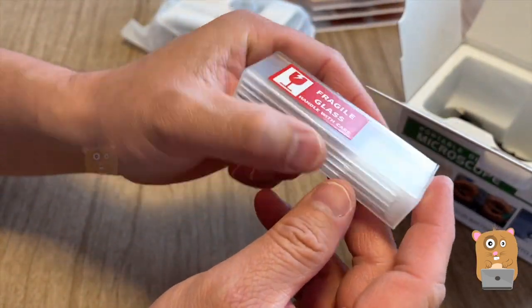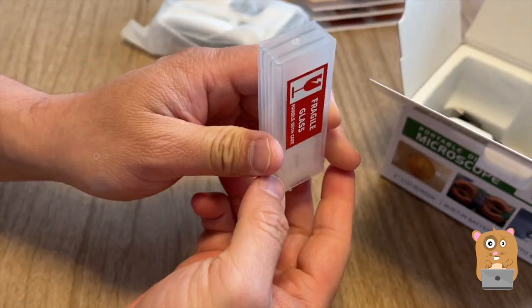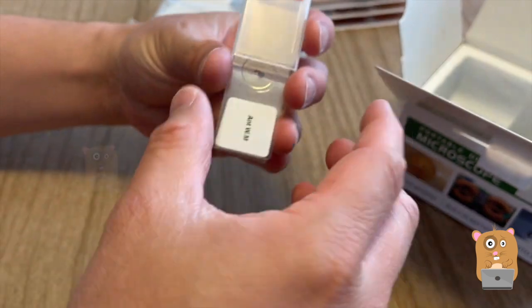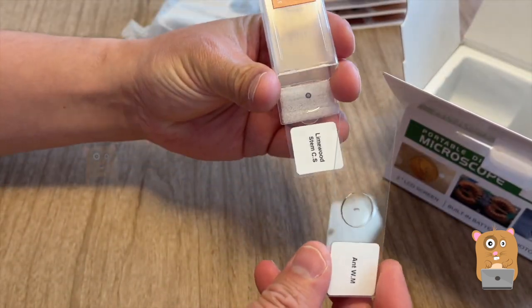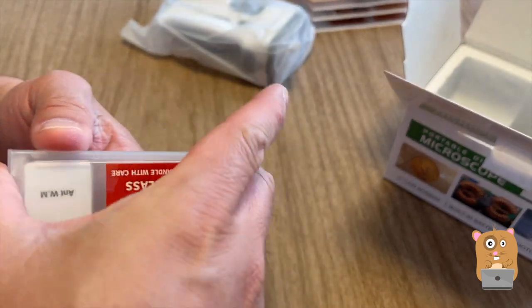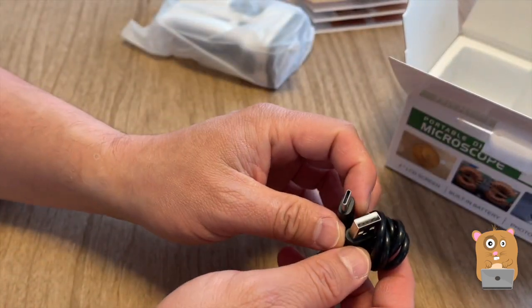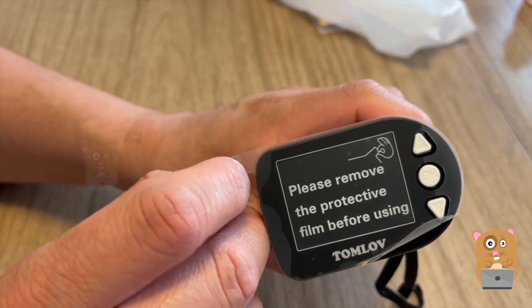So we got some glass slides — an ant and limestone. They're just two slides. For the power cable, it's a USB Type-C. Please remove the protective film before using.